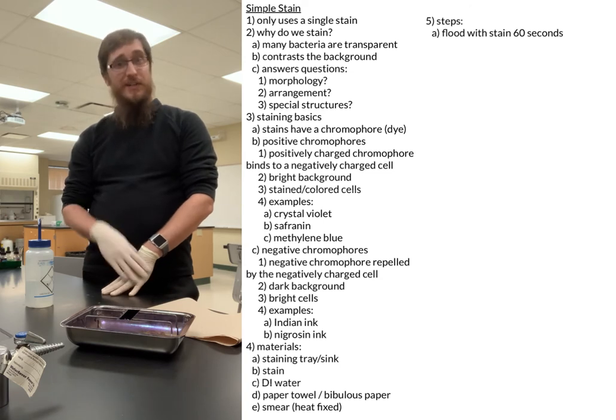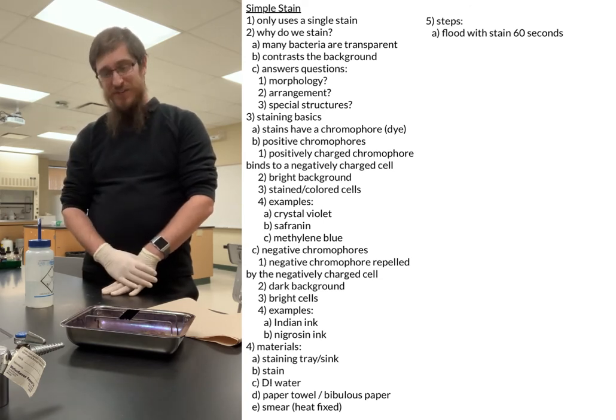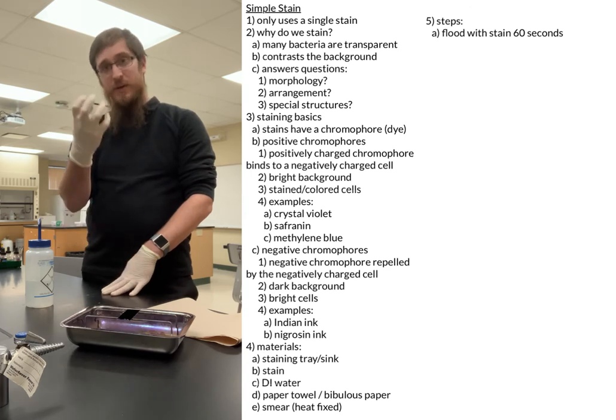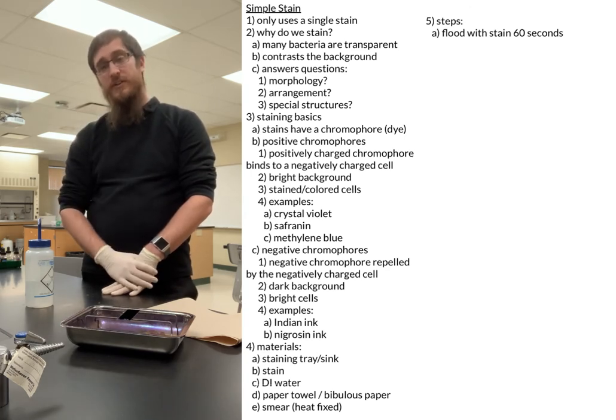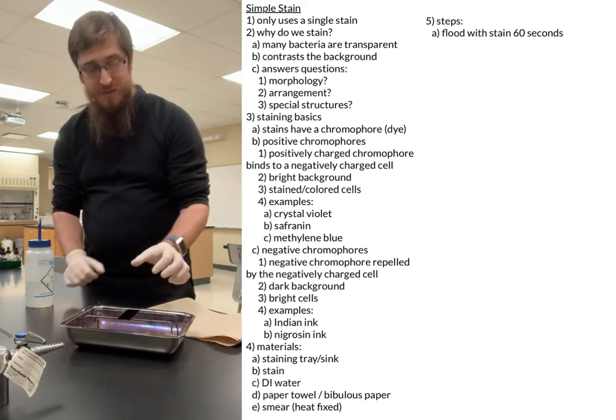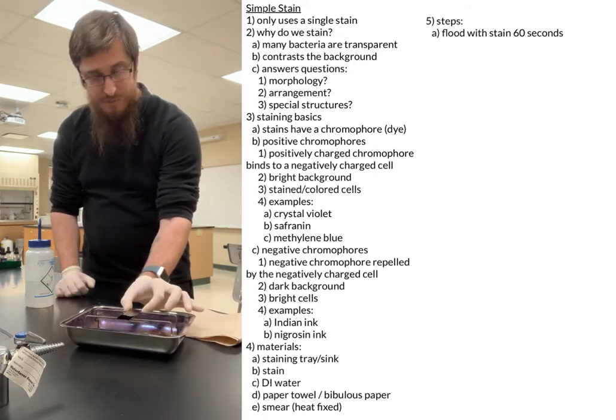I'm going to skip some of that waiting to show you guys what else we're supposed to be doing. But normally, you're just going to wait about 60 seconds or so. That's going to give the dye a good time to really soak into the bacterial cells, and we should be able to get a good view of what we're seeing under the microscope.